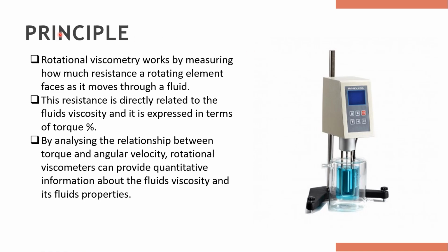Working principle of rotational viscometers. Rotational viscometry works by measuring how much resistance a rotating element faces as it moves through a fluid. This resistance is directly related to the fluid's viscosity and it is expressed in terms of percentage of torque. By analyzing the relationship between torque and angular velocity, rotational viscometers can provide quantitative information about the fluid's viscosity and its fluid properties. To understand the working principle of the rotational viscometer in detail, we will first see the fundamental components, then the procedure. Then you can get a clear idea about the working principle of rotational viscometers.